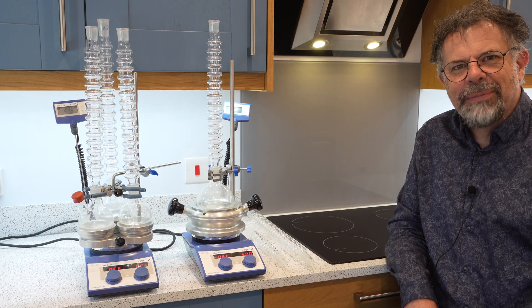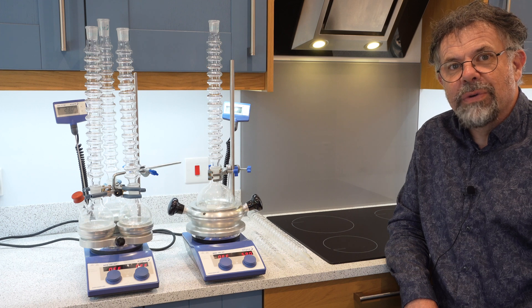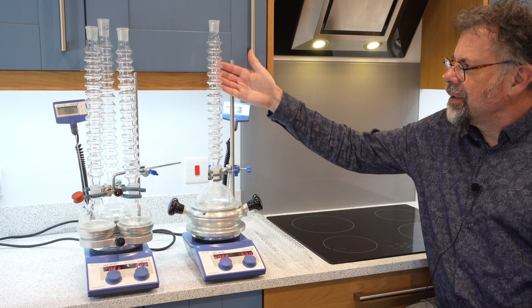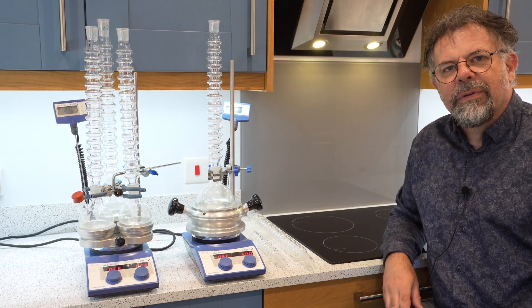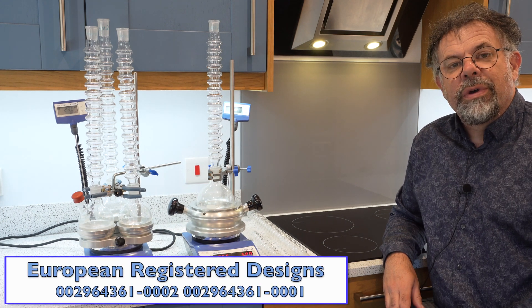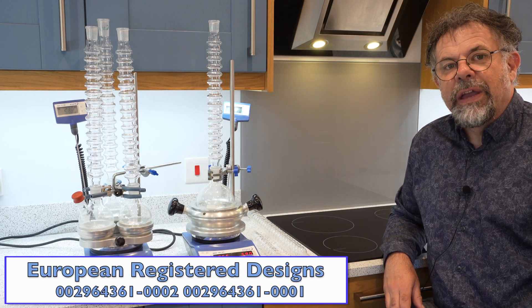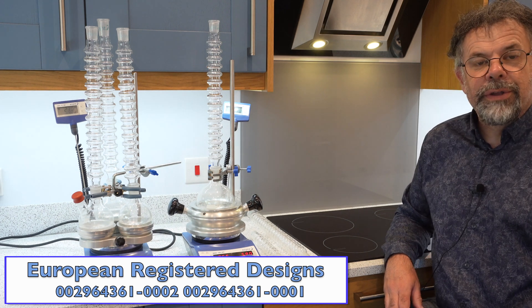Welcome to Asynt. My name is Martin Fordham and today I'd like to introduce you to our Condensin waterless condensers. Condensin are very simple but very effective air condensers and they work pretty much just as effectively as a water-cooled condenser of the Liebig variety.